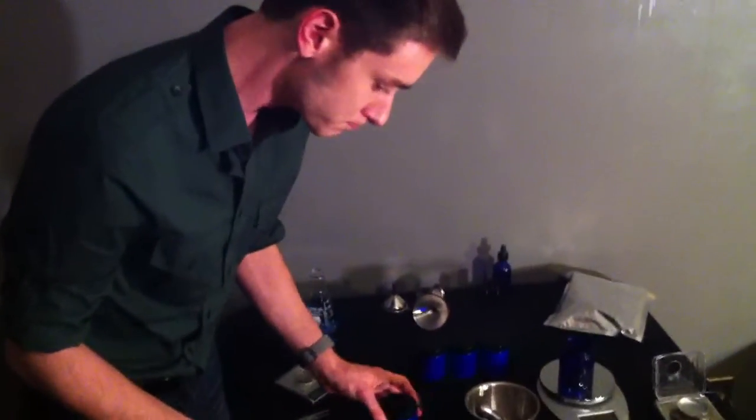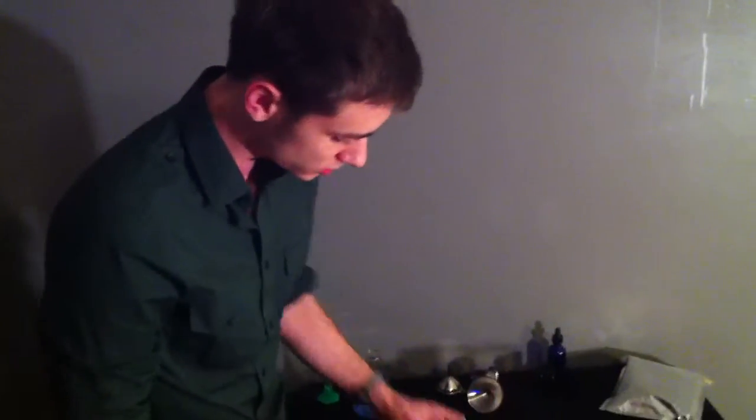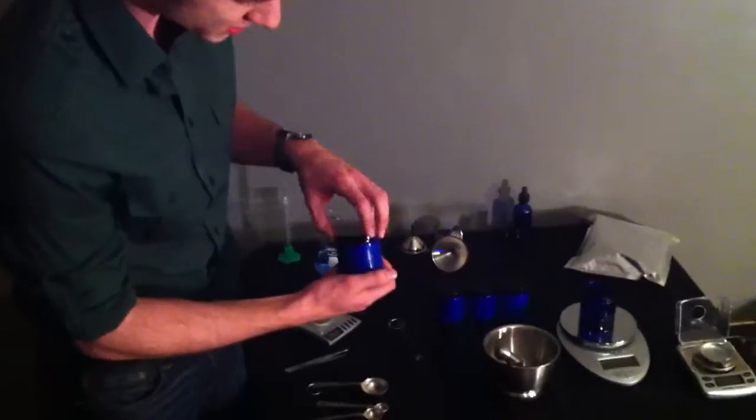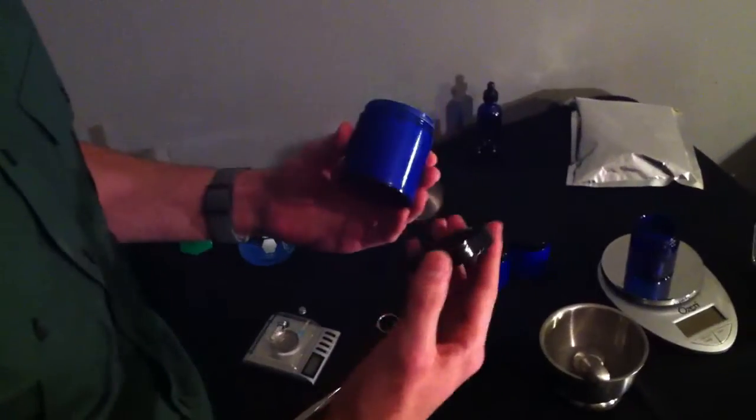So what we're going to do is make a 5% solution. When you receive the NRF cream, it's going to come in a jar about this size. Similar to normal RU, we aren't totally sure about the stability, so you wouldn't want to make an entire jar with the RU. You want to make up smaller batches. To do that, we're going to weigh out 40 grams of the cream and then 2 grams of the RU, because that would be 5%.